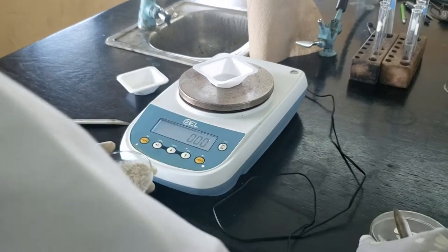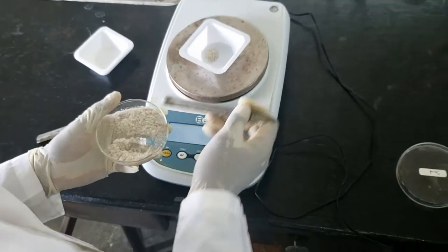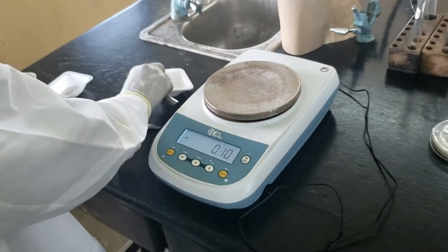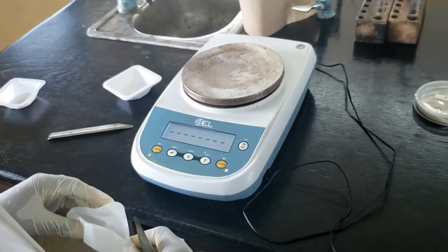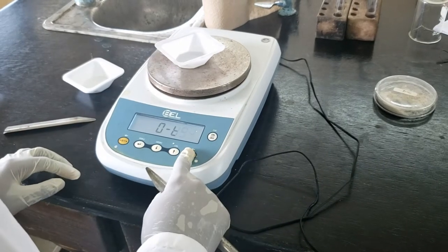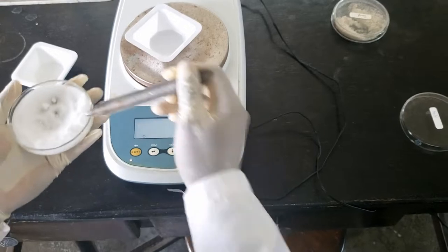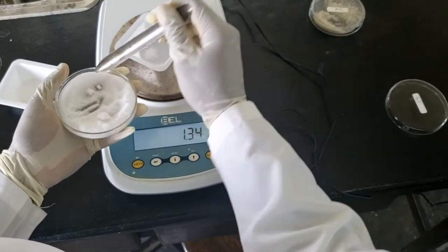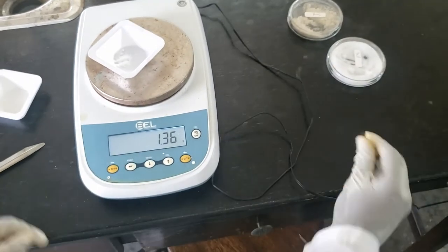Then we can just weigh the sand — anywhere between one to two grams should work. So that's 1.30 grams. Let's try to get the salt in generally the same range — they don't have to match exactly, but that should work. We are at 1.30 grams of sand and 1.36 grams of salt.